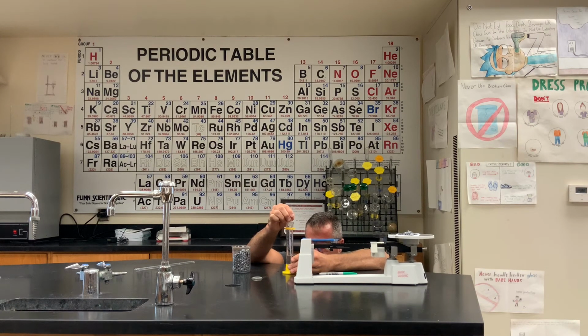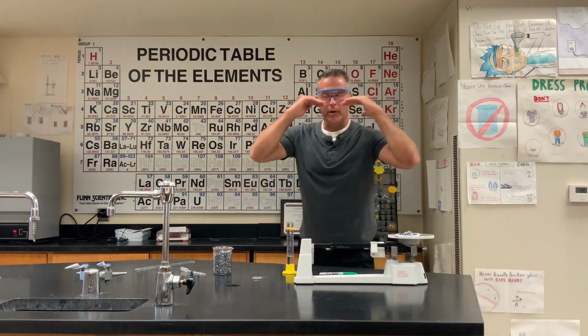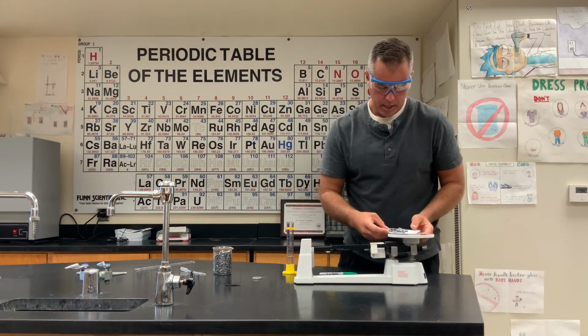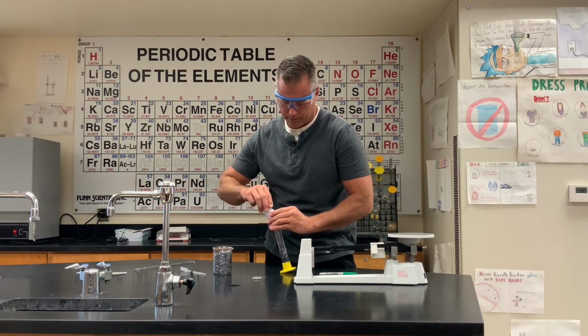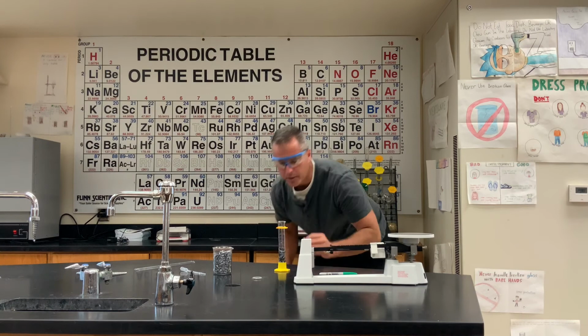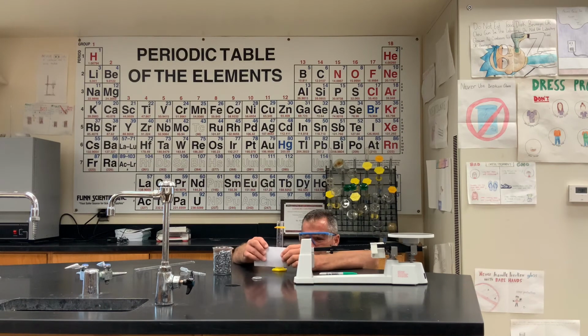Alright, my starting level is 20.00 milliliters. So that's how much I initially have in there. And I got my eyeballs right down at the meniscus, so I was right on it and could see it perfectly. I'm now just going to fold up my note card, dump all my space rocks in, and the volume of this will go up. Okay? Good. Completely submerged. I'm going to tap on it and try to get all the air bubbles out. And now I'm going to take another peek at this.